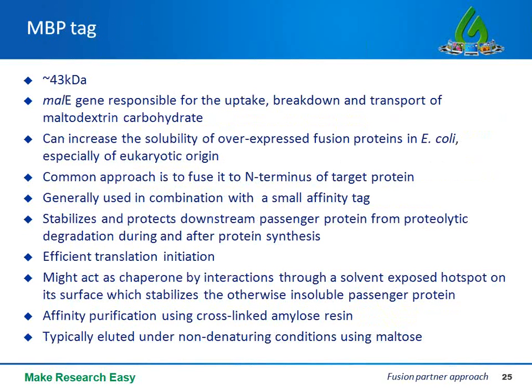MBP is quite robust. It's been widely used. It's an approximately 43 kilodalton tag. It naturally occurs in several bacteria, and primarily in E. coli. It's encoded by the malE gene, which is responsible for the uptake, breakdown, and transport of maltodextrin carbohydrate.